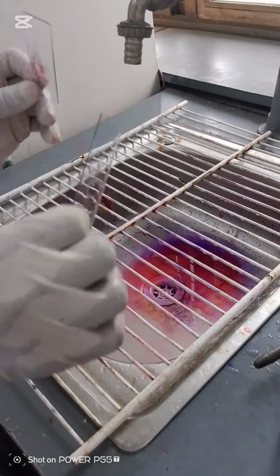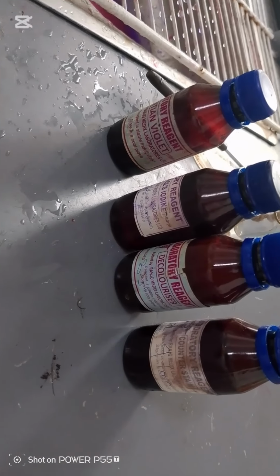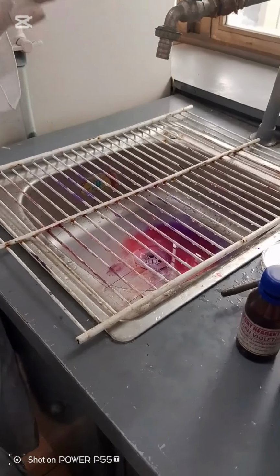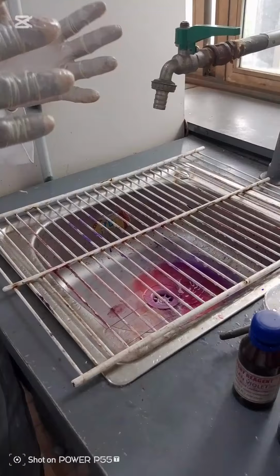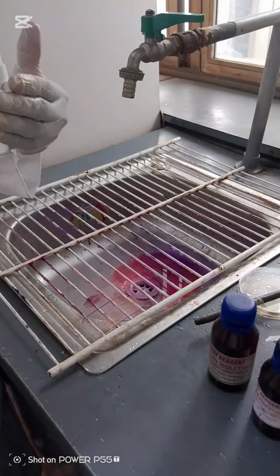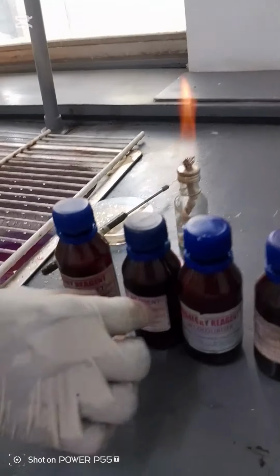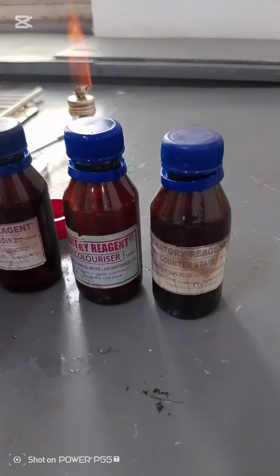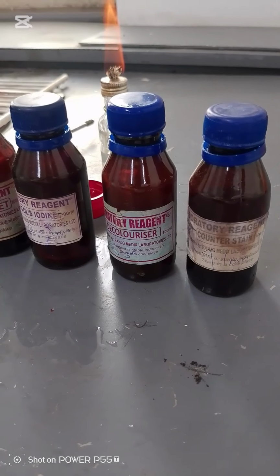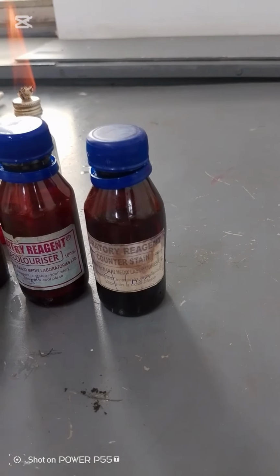I said earlier that gram-positive bacteria has a cell wall that is made majorly of peptidoglycan, over 60% of the cell wall. So when you add the primary stain, it will pick the stain. When you add Lugol's iodine, which is a mordant, it allows the stain to form a complex with the bacterial cell. When you add the decolorizer, it will not wash off the stain because it's a gram-positive bacteria. And then when you add a counterstain, it will not pick the secondary stain.